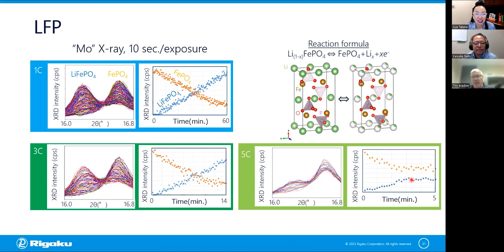So we just spoke about how we can penetrate the copper current collector on the backside of the anode. It's only about 10 to 15 microns thick, so we can easily penetrate that with molybdenum, and realistically you can penetrate it with copper as well. But the second half of the question is, what if the anode material is amorphous but potentially crystallizes during a cycle?